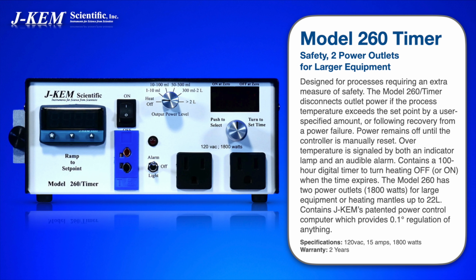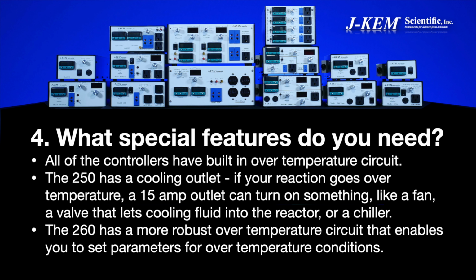But there are situations where a single overshoot of the set point is not acceptable. And in those cases, something like the Model 260, where you have an optional circuit that you can turn on, and it says if you go over temperature one time, you turn off and you're done until I come back in and manually reset that controller. So with the different models of controller, you can decide what happens when you go over temperature. If you go over temperature and then it cools back down, do you want it to resume heating? Or if it goes over temperature, is it just absolutely turned off? It will not resume heating until you manually reset the controller.